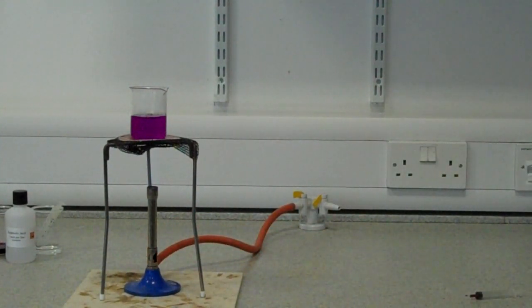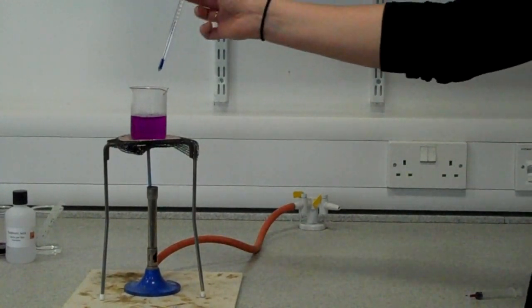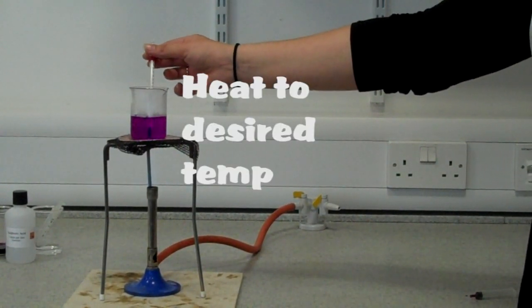We take the beaker from the tripod before it reaches 40 degrees as the heat from the glass will raise the temperature, and we stir the mixture for an even heat distribution.